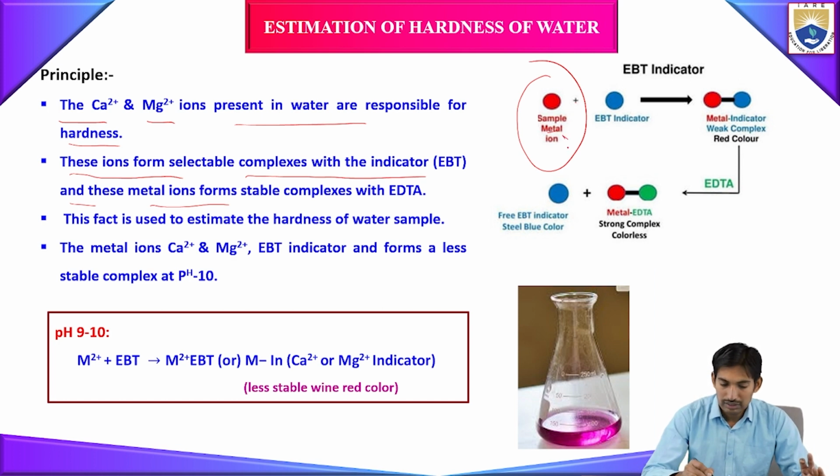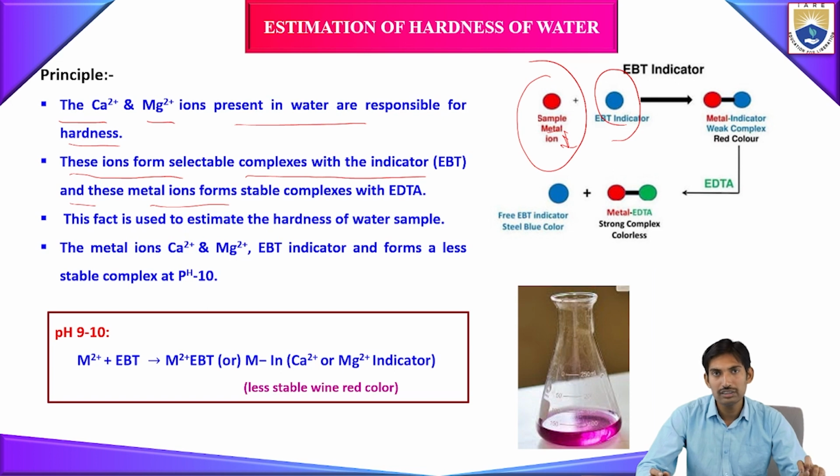When we add EBT indicator to this hardness containing water, which contains calcium and magnesium ions, these ions form a complex with the EBT indicator.